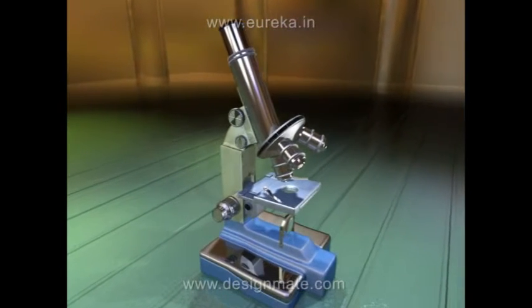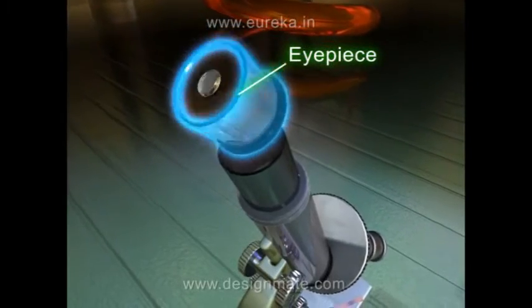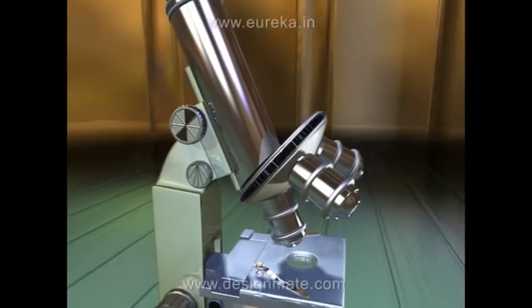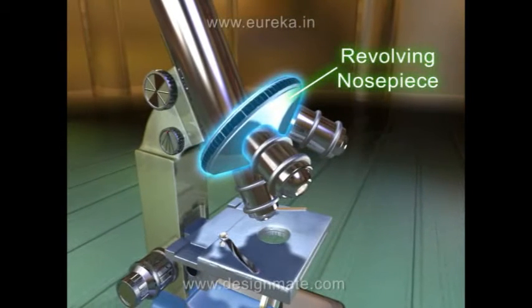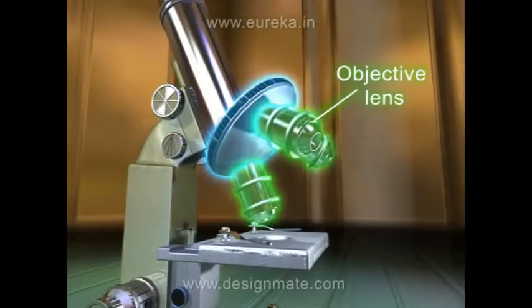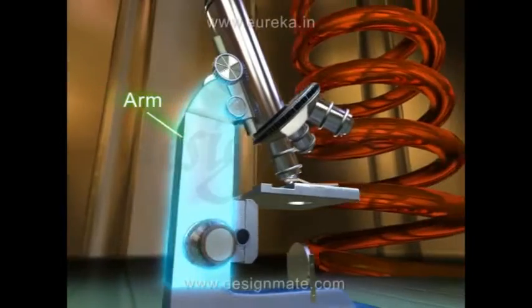We will first study the external construction of the microscope. The compound microscope consists of the eyepiece through which we see the image of the specimen. Then is the body tube, which is the long tube holding the eyepiece and connecting it to the objective. This is the nose piece, which holds the objective and is the rotating part of the microscope. Then we have the objective lenses, which are attached to the nose piece. The arm is the part of the microscope with which you can hold the microscope.